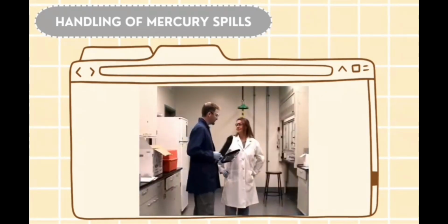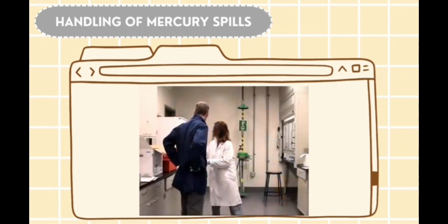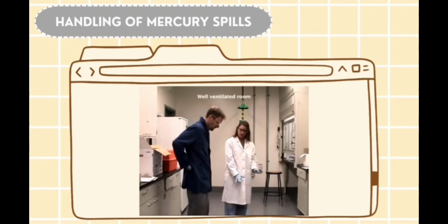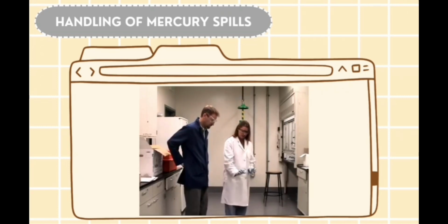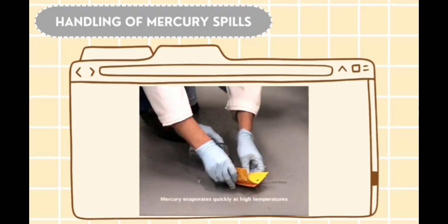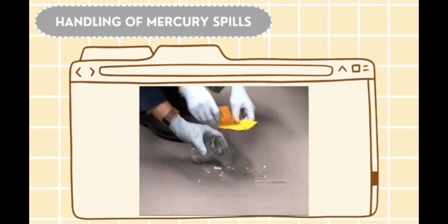I got a broom and a dustpan. You know, that'll just contaminate the broom and the dustpan, so we're not going to use that. What we need is just some paper right now to pick up the visible mercury. Actually, this jar right here will work perfectly. We're going to scoop the mercury in the glass up with just 2 pieces of paper, and just be careful of the droplets of mercury because they do tend to spread. If you can see here, there's little balls all over the place. And I'm going to take these 2 pieces of paper and... I am so glad I didn't break this in the incubator. That would have vaporized the mercury too much, and we couldn't have done this ourselves.